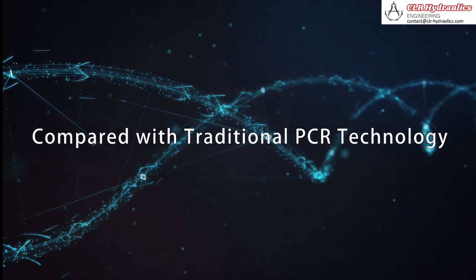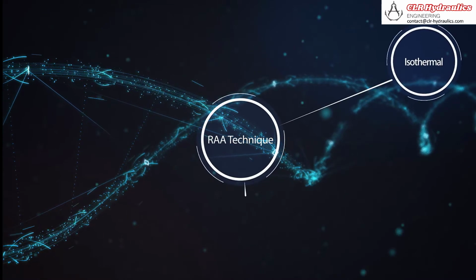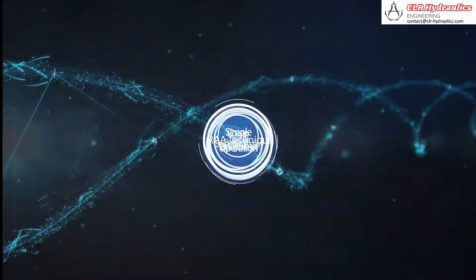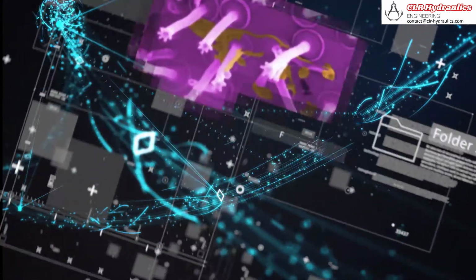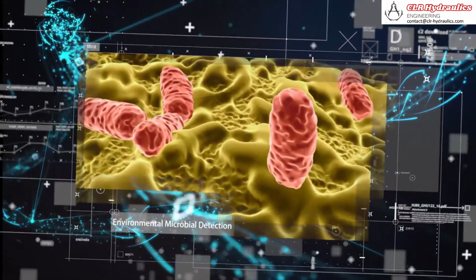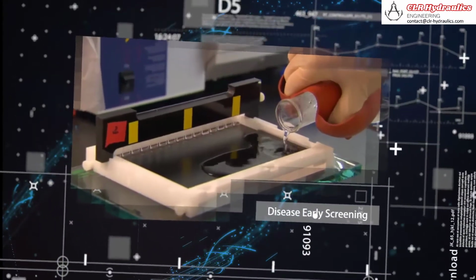Compared with traditional PCR technology, RAA technology has the advantages of isothermal, rapid, portable, sensitive, specific assay, cheap equipment, and simple operation. Currently, RAA has been applied in the fields of inspection and quarantine, disease prevention and control, food safety, species identification, and environmental microbial detection. It is particularly suitable for POCT, disease early screening of acute infectious disease.